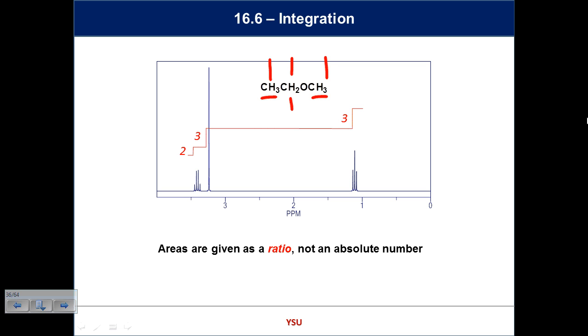So in this example, we can see now some shape. Don't worry about shape just yet, but we can certainly see chemical shift based on what type they are, based on electronegativity ideas and their proximity to the electronegative atom. But we can also see the graphs. We can also see the integration. This one down here apparently is worth 2, that's worth 3, and that's worth 3 if you measured underneath those curves. So which signal is this? If I label this 1, 2, 3, which signal is this to the right? 1, number 1, all the way to the right. What about this one here, this line that's quite large? It's worth 3 protons, so which one is it? 3, it's the methyl group. And then down here is the CH2 group.